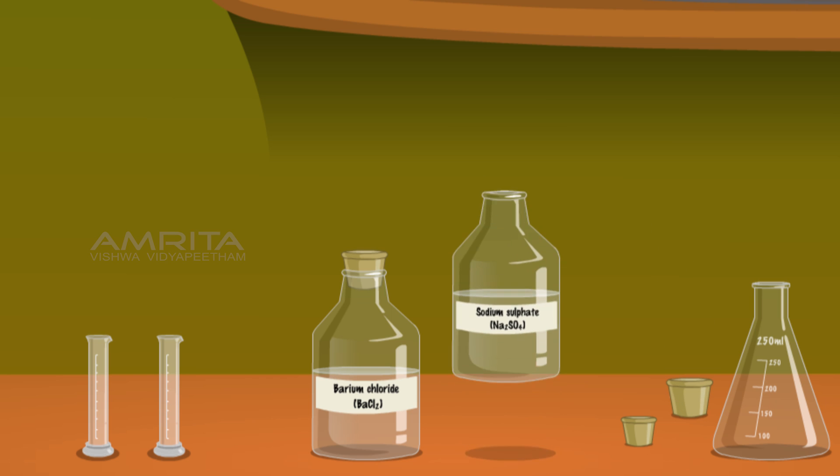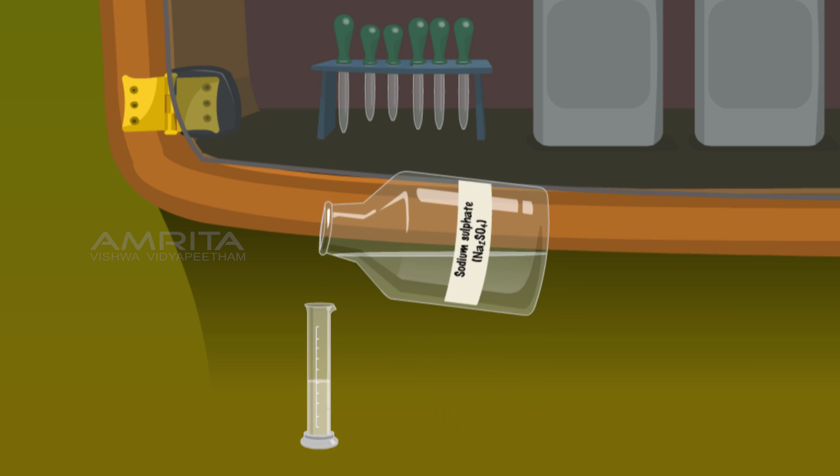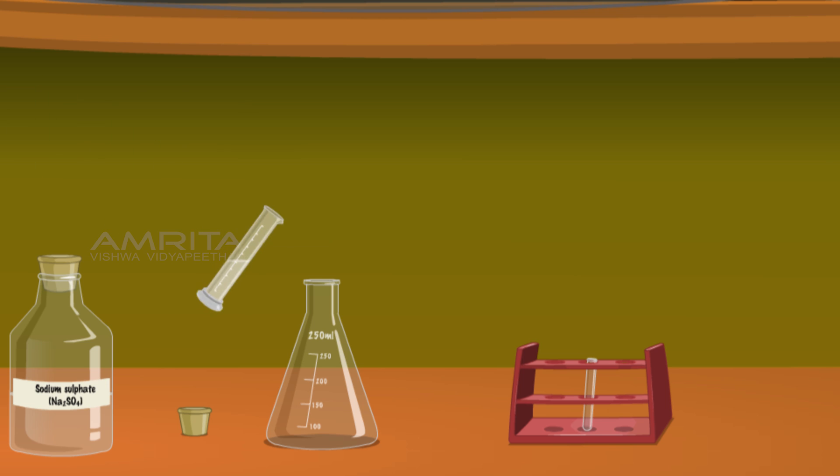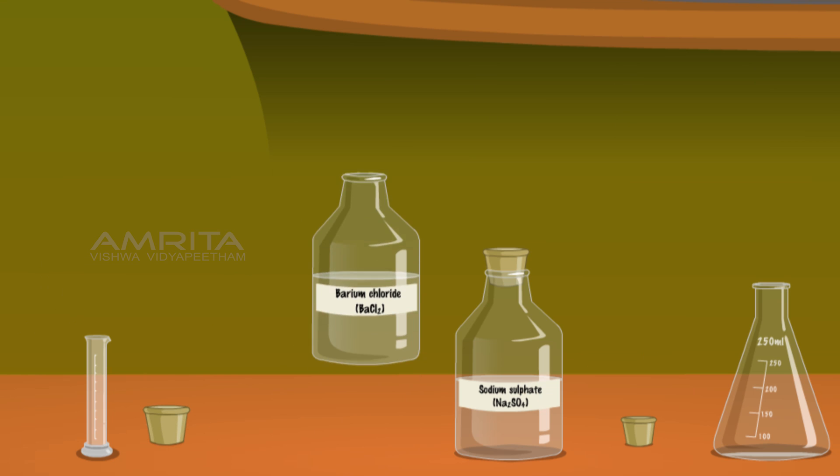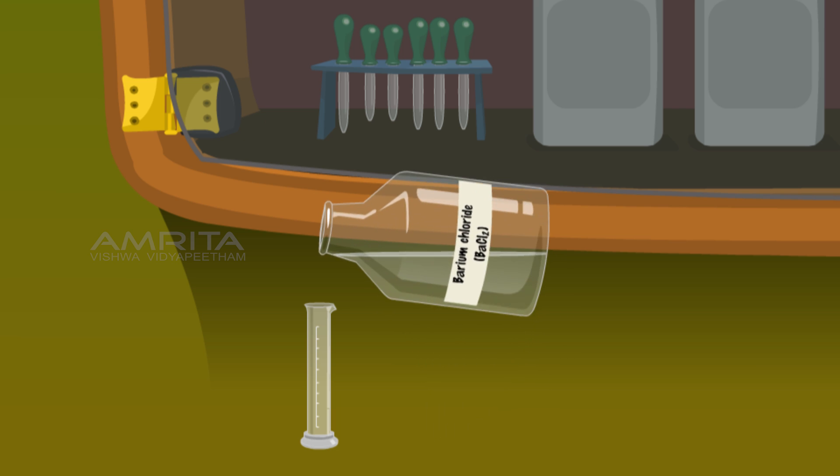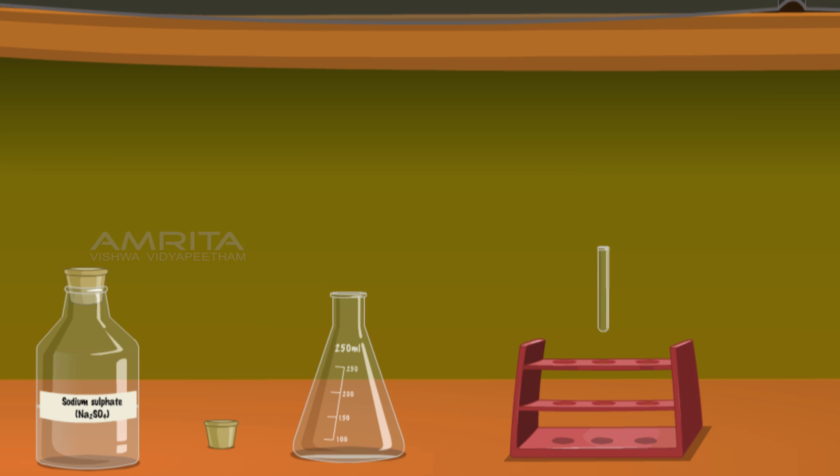Measure 5ml of sodium sulphate solution in a measuring cylinder. Pour it into a conical flask. Measure 5ml of barium chloride solution in another measuring cylinder. Pour it into a 10ml test tube.